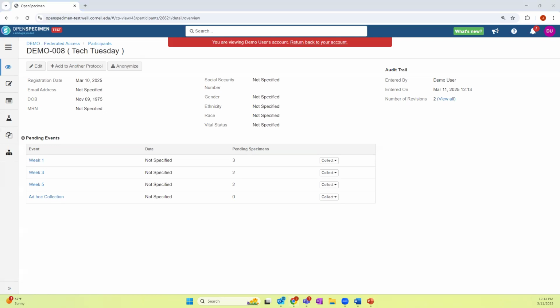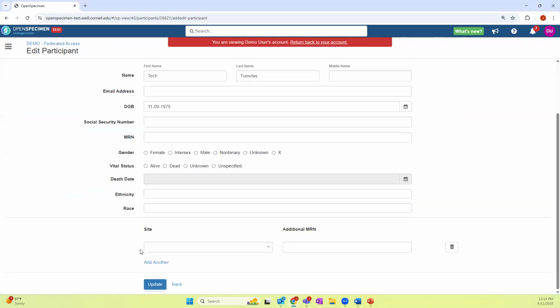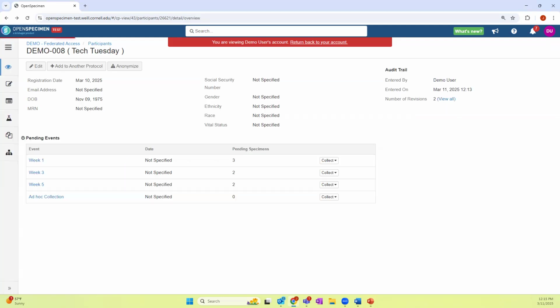All right, and just quickly, I see a question from Bruce in the chat. OpenSpecimen is set up to receive fully identifiable research information. Can it be used to work on just subject ID? It can, Bruce, yes. There is the ability to remove all identifying information when you are entering data into OpenSpecimen. Essentially what we do is take out all of the identifiable fields from the data entry page, and you just enter a basic subject ID.